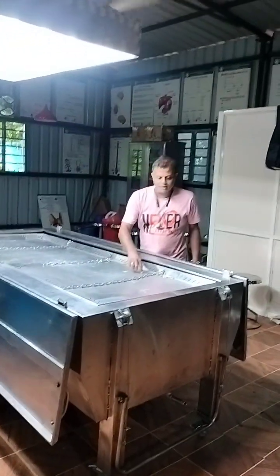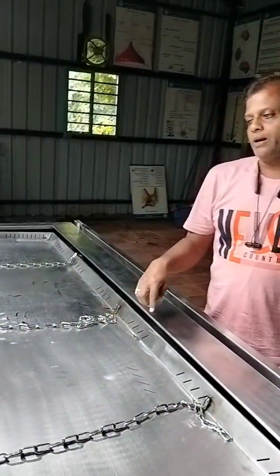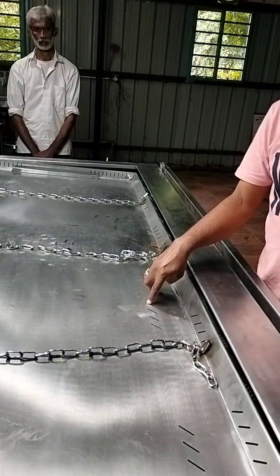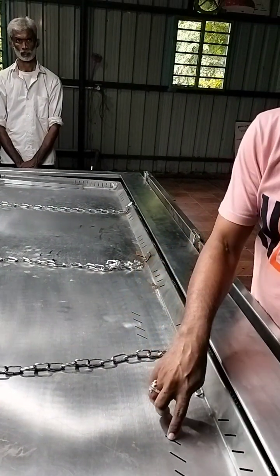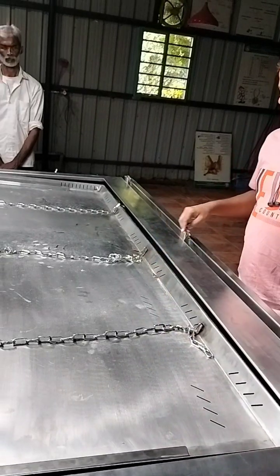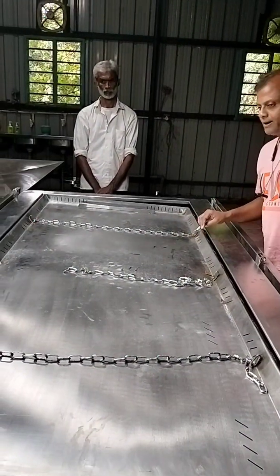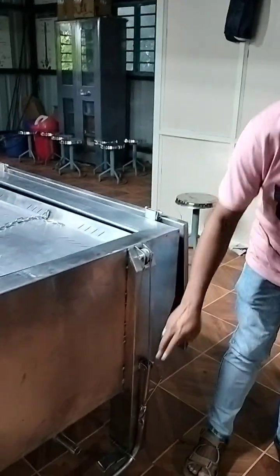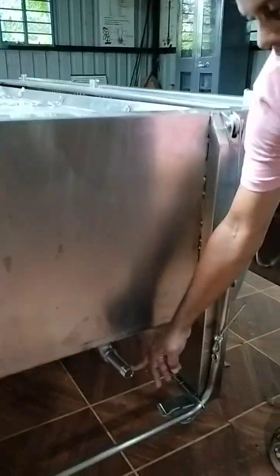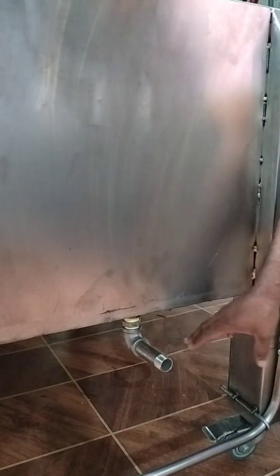You can see here there are drain points everywhere, which ensures a heavy weight body can be lifted. The buoyancy of the body can be countered using these liquid pullers, wherein liquid will get drained here. And here we have a drain point where if you want to take out the liquid and put fresh liquid, you can drain it using a tap.